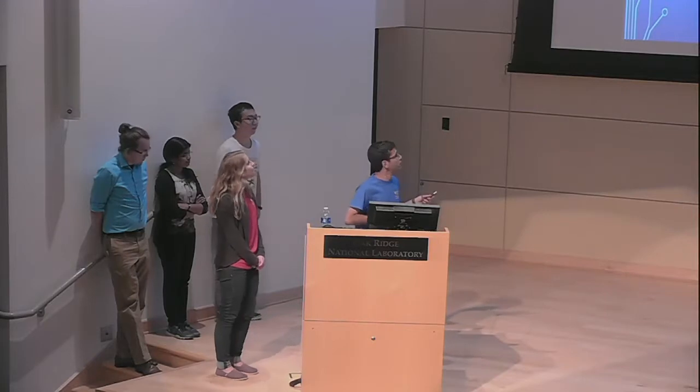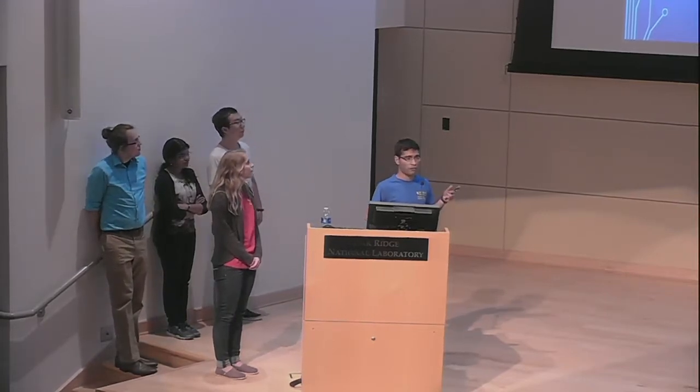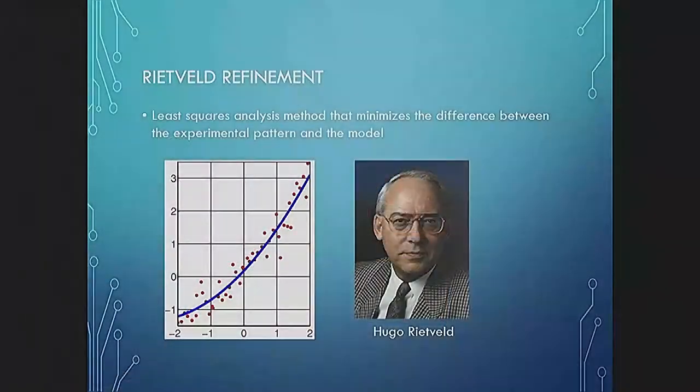So the next step is the Rietveld refinement. So now that we got the 2 different phases, we need to analyze the data. We can determine the phase of the individual structures, which is the copper oxide and copper, by looking at the Miller indices and doing a pattern match from the database. But to do a quantitative analysis of the mixed phases and to completely validate the structure, this Rietveld refinement is used to do this process.